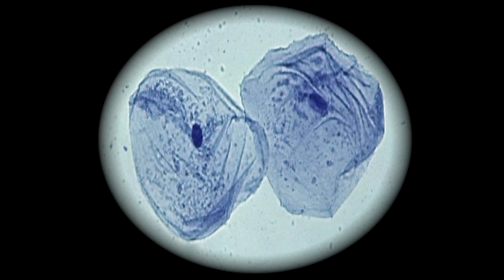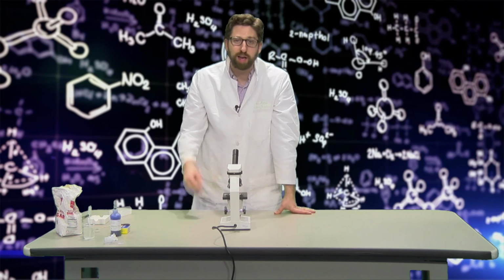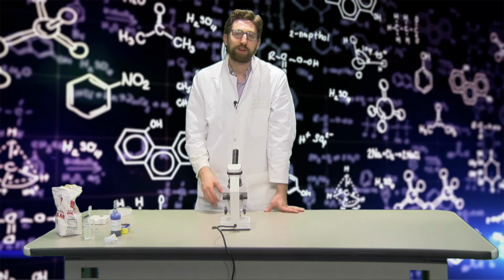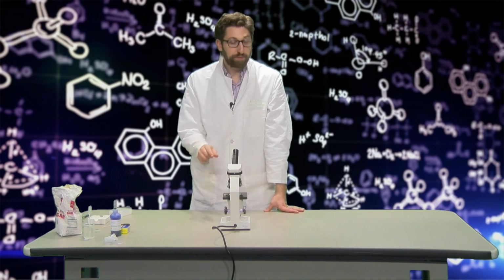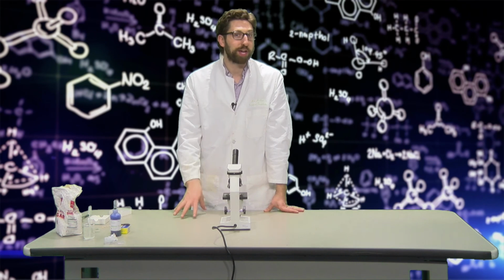There's actually a name for these things. These are my cells, the smallest part of me that can be considered alive. All living things are made of these. But if you want to learn more about these, we'll have to start again another day.